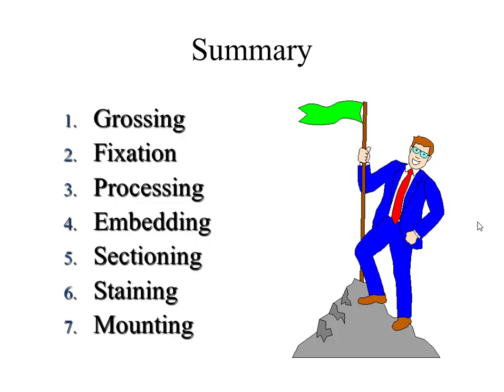So, our procedure of preparing a slide includes gross examination with a gross description, fixation, processing, embedding in paraffin, sectioning into small pellicles, staining with hematoxylin-eosin, and mounting.